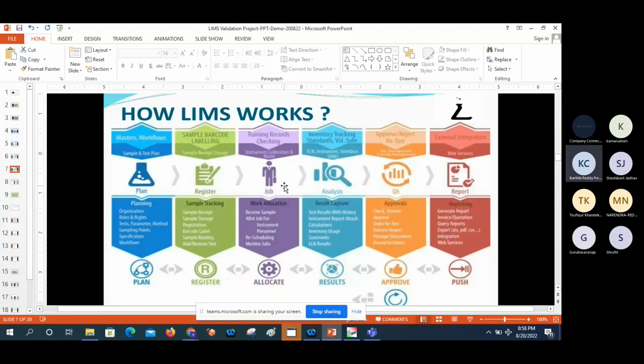Instead of that, if we implement a document management system as part of digitalization, it can track all of this. That is also one type of qualification we need to perform, for the DMS. All the necessary specifications, STPs, and protocols can be put in the DMS. If we integrate the DMS with the LIMS, we can log in directly through the electronic computer system and easily verify the specifications and STPs instead of verifying the existing manual data.